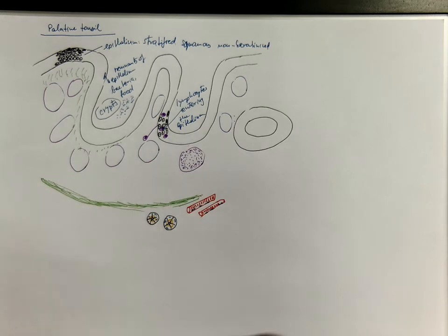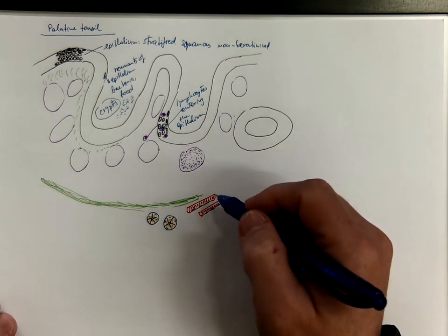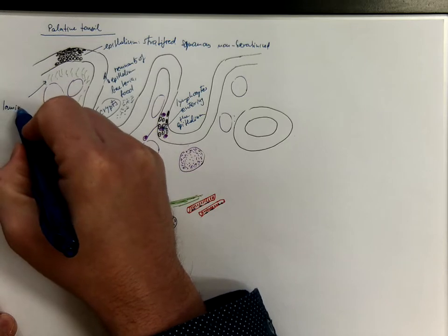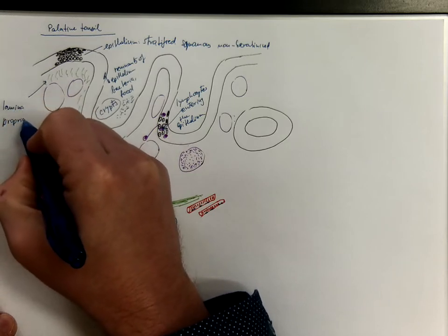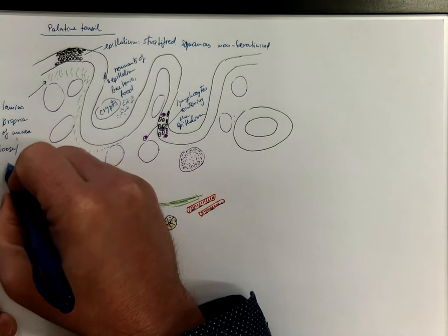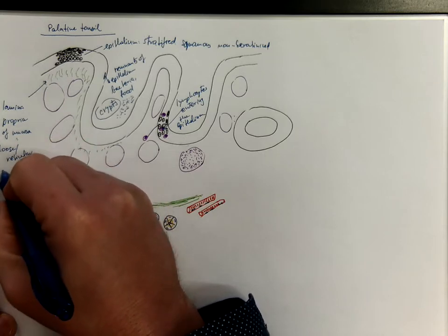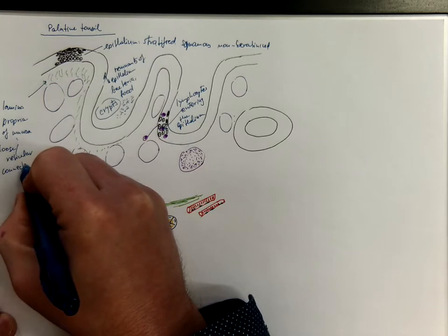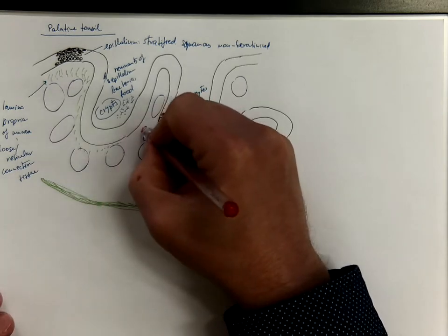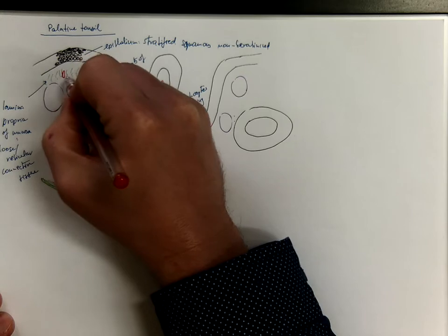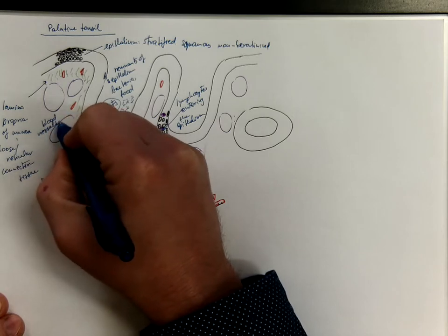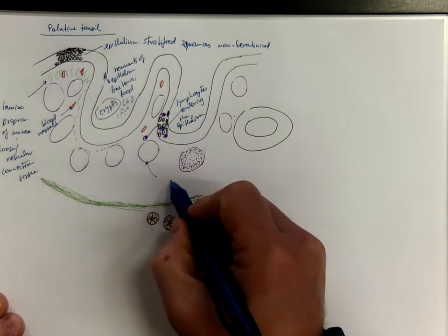So let's label the slide. Here is the lamina propria of the mucosa. That's loose or reticular connective tissue. So I should actually include also blood vessels here.